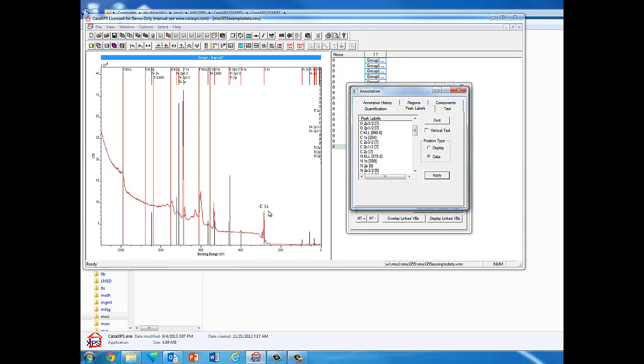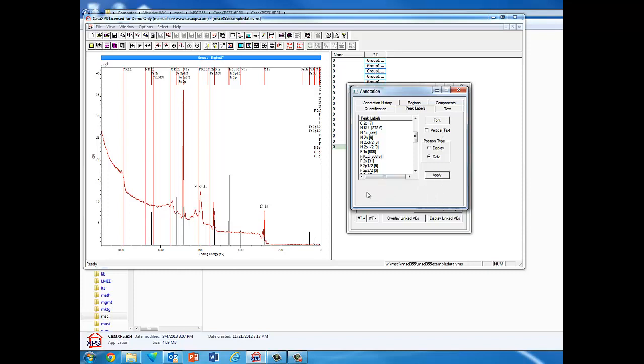For the peaks you're sure of and know where they're located, we can go through and do that. Another prominent peak here is the fluorine KLL. If we look for that at about 608, select that, keep the font the same, and then apply, that gets labeled. It makes it a little cleaner and easier to see the labels on the graph.